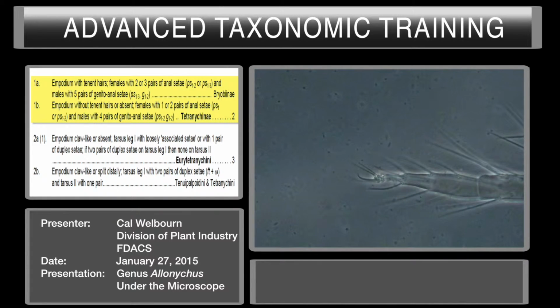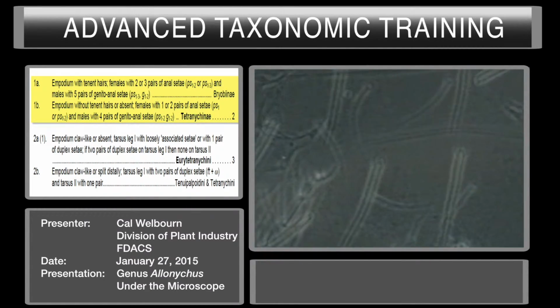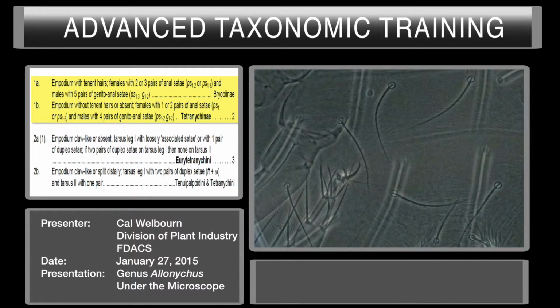This is leg 3. It's a little better. You see 1 pair of claws with tenent hairs. Here's the empodium, and you don't see any tenent hairs coming off the empodium. If you look very carefully in this view basally, you'll see a few little hairs coming off. Find a better view. Here's leg 4. There's the view of leg 4, distal end of leg 4. It comes around, loops here. Here we can see the empodium very clearly.